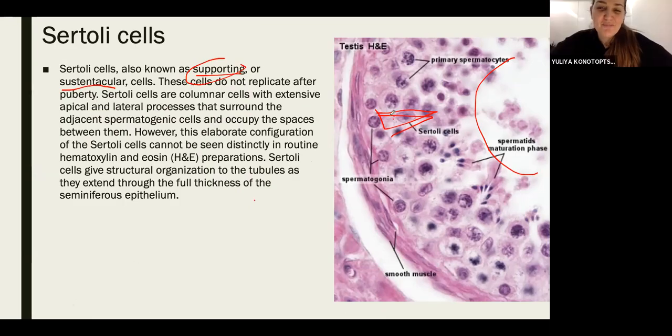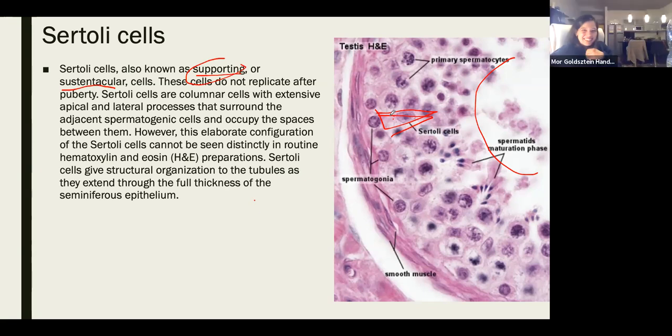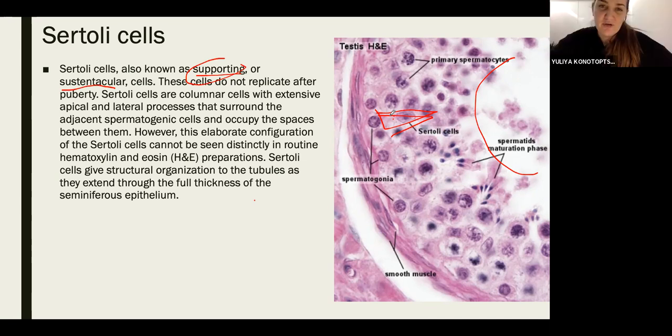Yeah. Julia. I cannot see the triangular shape of this. I know this is in the book. I will show you in our slide, and I think it's a bit better. I keep saying triangular shape because in our slide it's much better. Okay.